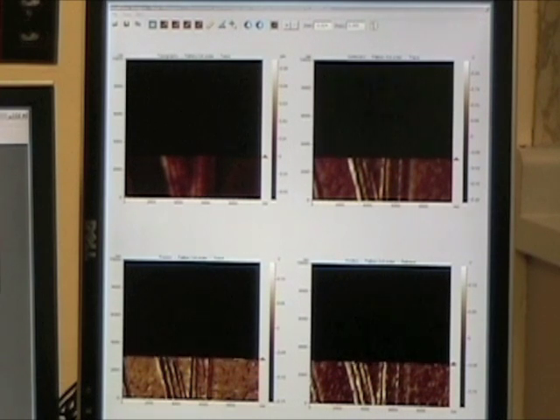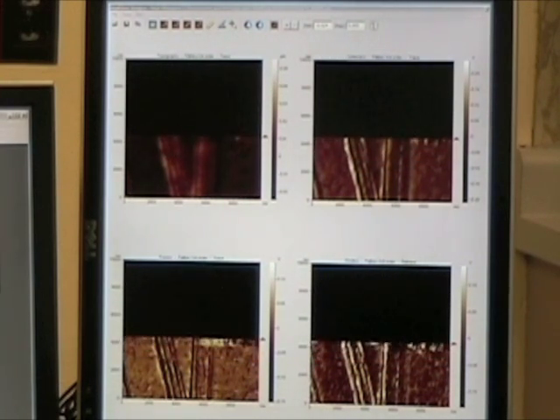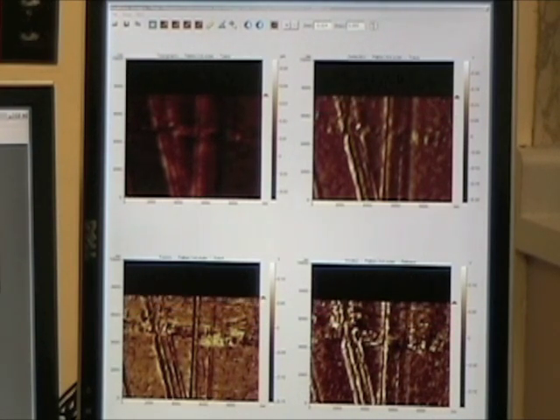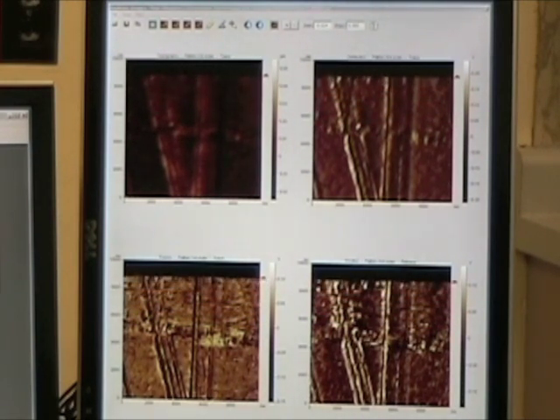This is the same principle that we saw earlier with the mechanical scanner, which gave us a physical image we could see. But, similar to the AFM, the image of the actual sample could not be seen until it was scanned.